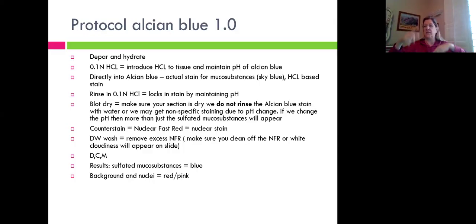And the reason I do that is because there may be dust or other chemicals floating around. I mean, that's what the hood's for. So I want to make sure that I'm protecting that section from getting dust and particles all over it. So I'll lean it up against the wall, not directly against the wall, but enough for airflow to go in between the section and the wall of the hood. And I'll just let it sit there until it dries.